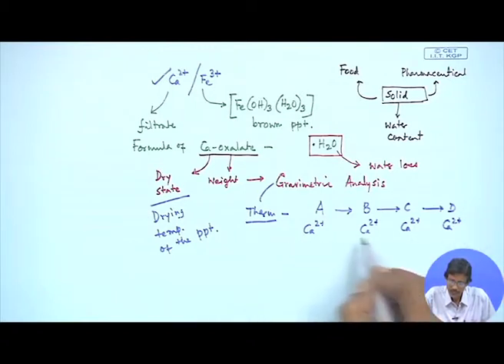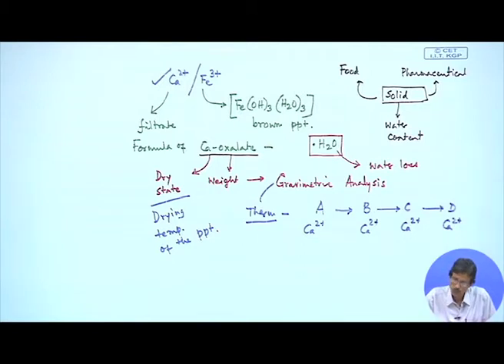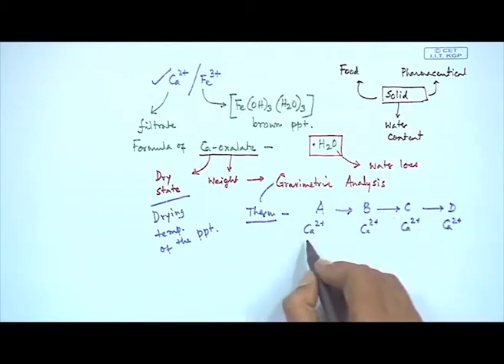So, these are therefore the conversion of A to D. If we want to measure or if we want to find the corresponding calcium content of the pure solution.